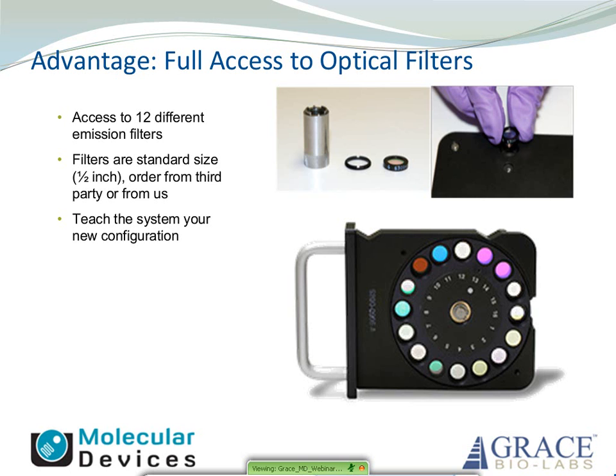And in one of our next webinars, we'll address the use of quantum dots. The blue laser and a nice set of filters will really show their importance for that, and certainly expand the capabilities of your multiplex assays.